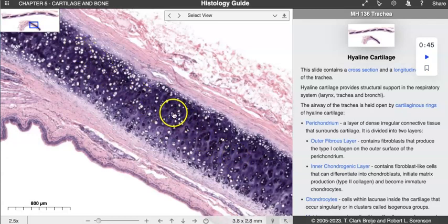And those white spaces are going to be the lacunae. Now, we don't see every single cell with every lacunae because, again, this is a flat section, right? We don't get to look at this in a 3D format of actually going through the entire ring of cartilage. So you're going to get little snippets of maybe the surface of the chondrocytes or the surface of, let's say, the lacunae in some areas. So these darker areas, that's exactly what that is. You're at the surface, before you would actually jump into that lacunae with the actual cell itself.